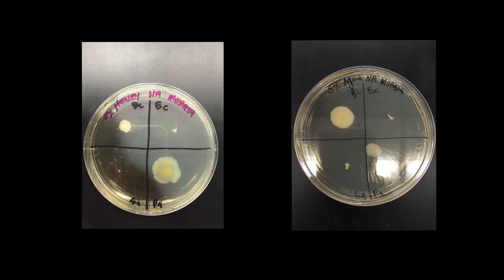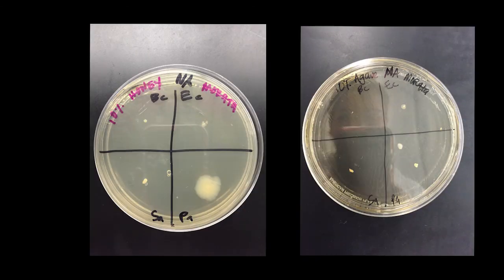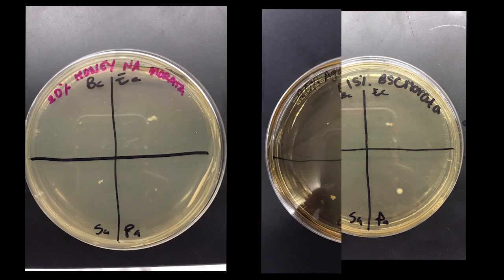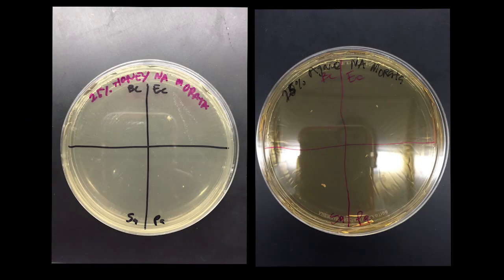Overall, we can see that honey inhibited growth. However, with certain types of bacteria, they behave differently. When conducting this experiment in the future, take into account that different types of bacteria react differently with different concentrations of sucrose and glucose.